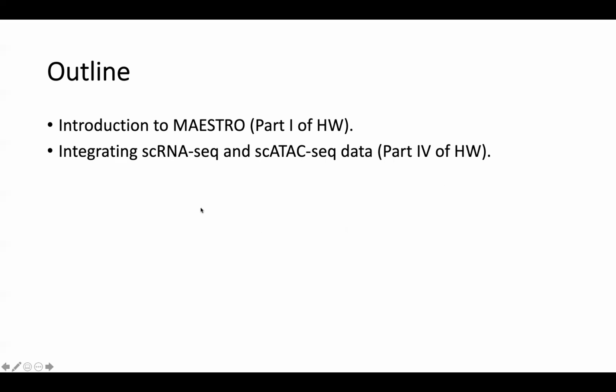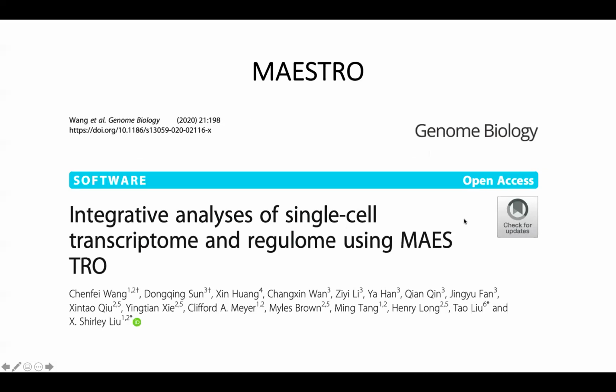So I'll have a lot of time at the end to answer more specific questions about the homework that you might have. Yeah, so first I just want to give a little bit of an introduction to MAESTRO, which is the software, or the pipeline, that you're using in part 1 and throughout the assignment. This was actually published by Professor Liu and her group just last year. So this is really at the forefront of research on bioinformatics, and it's exciting that we get to use it at this point in the course.